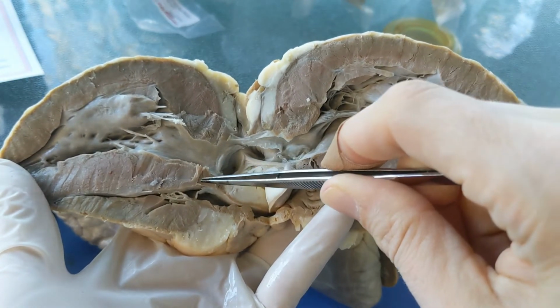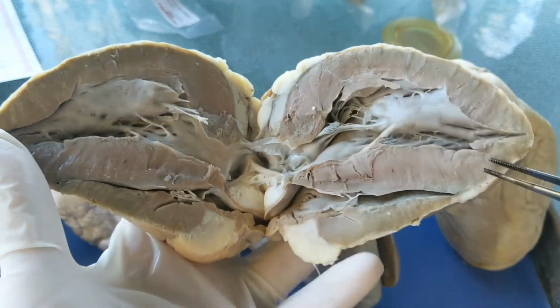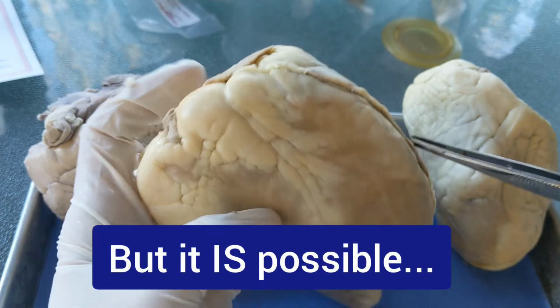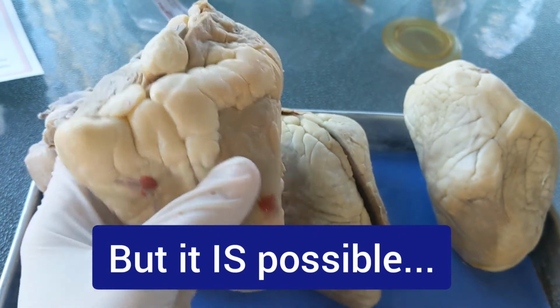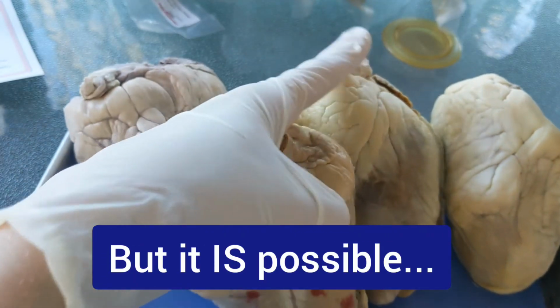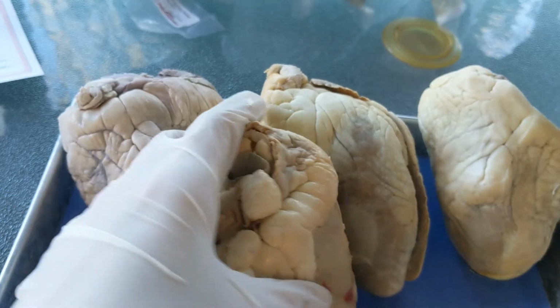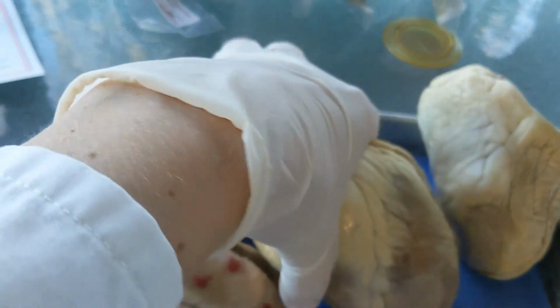And look at the septum between the ventricles. Look at the septum between the atria. See if you notice any problems with the septum. It's unlikely they're going to have more than one problem. So if you already noticed a problem externally, then they're probably not also going to have a problem internally. So that was B. That was our 57-year-old taxi driver who was found dead in his car.